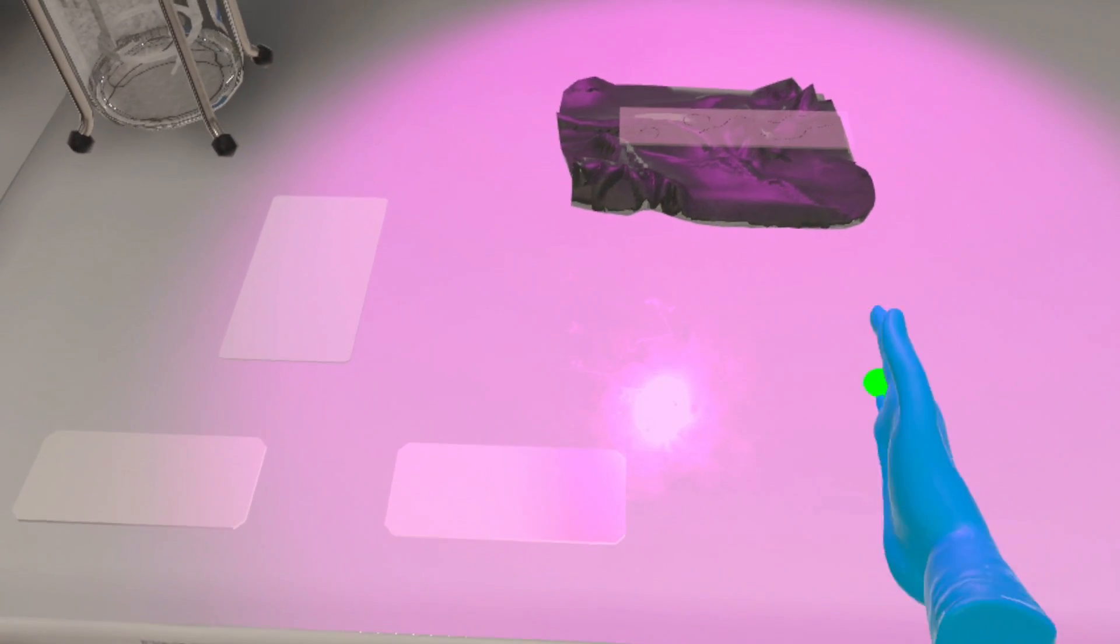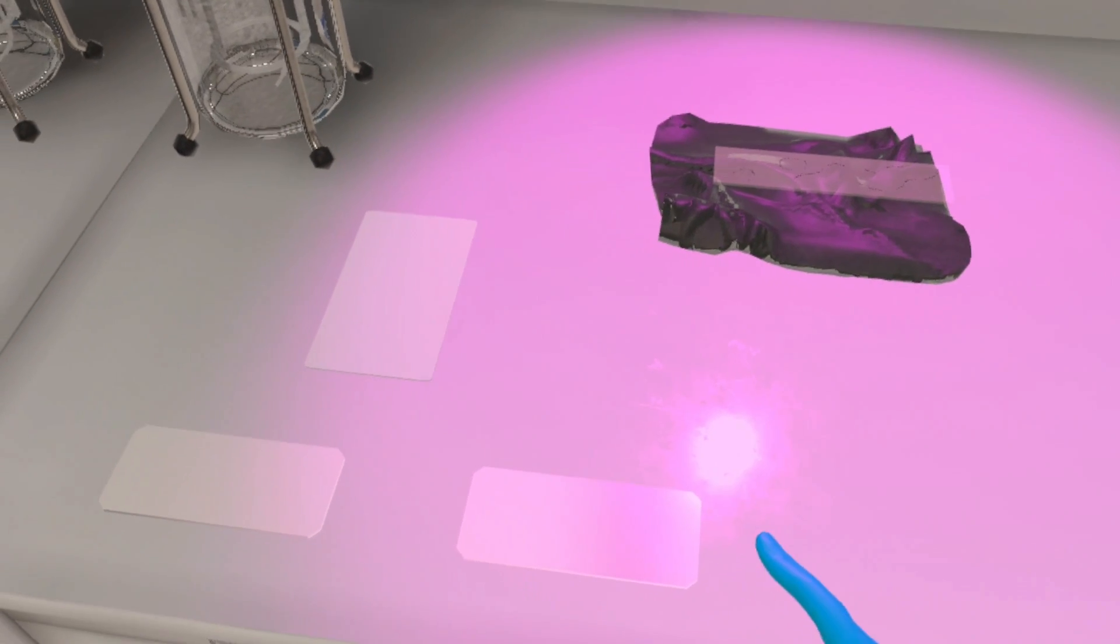Excellent job! Now collect the adhesive tape and properly place it in the highlighted bag, which has been labeled. Hopefully, the hair might lead us to the culprit.